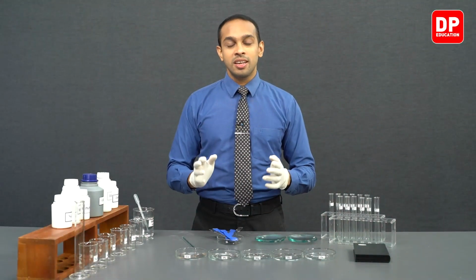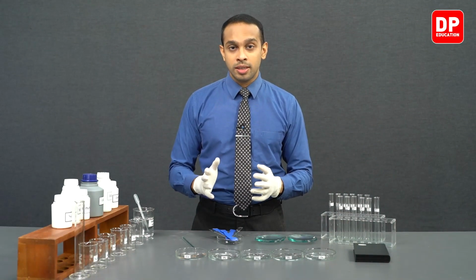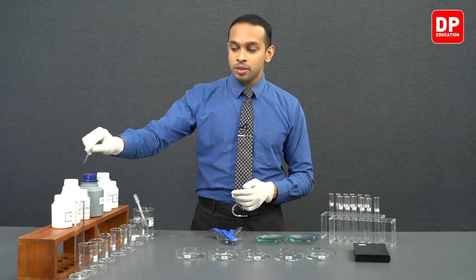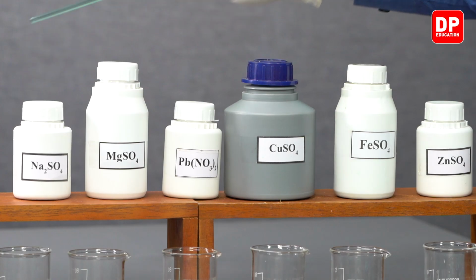So students, after identifying these aims, we can now move on to identifying the chemicals and equipment we will be using for this experiment. We'll be using sodium sulfate, magnesium sulfate, lead nitrate, copper sulfate, ferrous sulfate, and finally zinc sulfate.